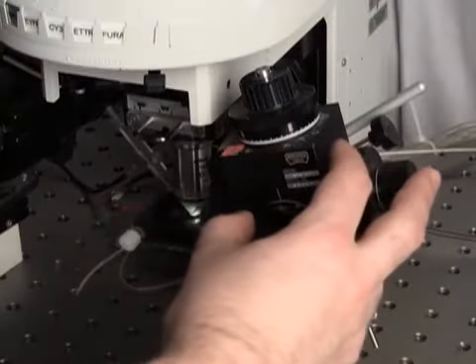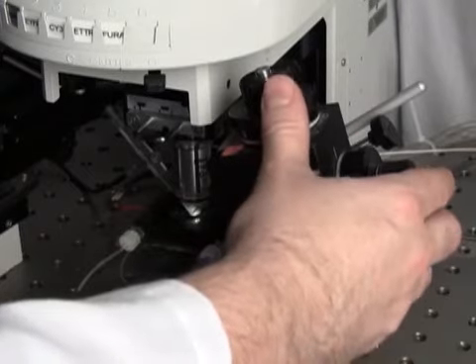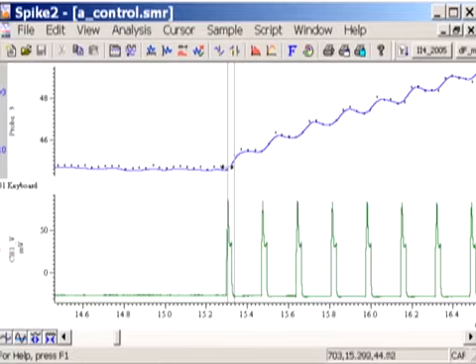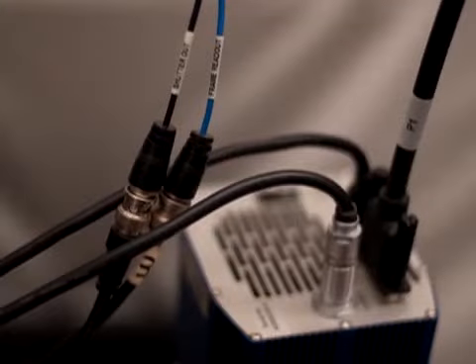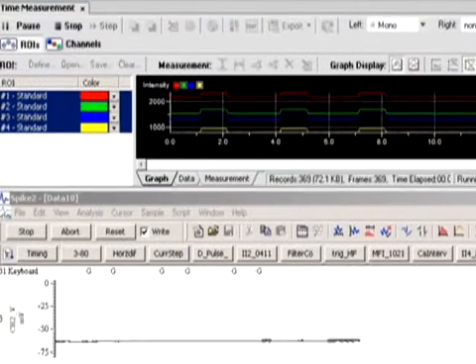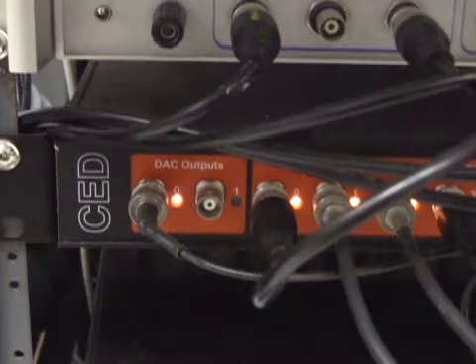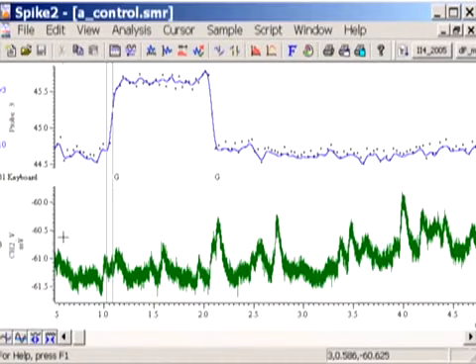Intracellular recording electrodes in the pre- and postsynaptic neurons are used to induce and monitor synaptic transmission. You can ensure synchronization between electrophysiological and imaging data acquisition if you use the camera's frame-out trigger signal to start the data acquisition software. Another way to ensure synchronization is to mount an LED inside the camera port. This LED is briefly turned on at the beginning of the recording session and thereby provides a synchronization mark.